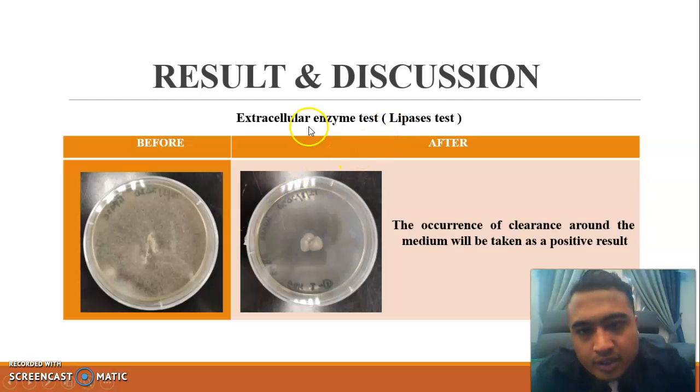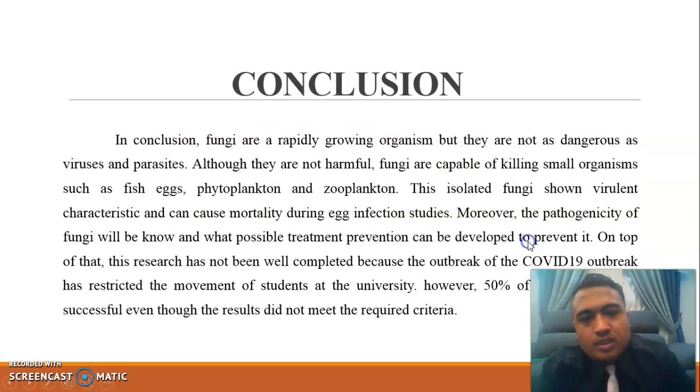And the third test for the extracellular enzyme test is the lipase test. This is before and this is after. The occurrence of clearance around the medium will be taken as a positive result.